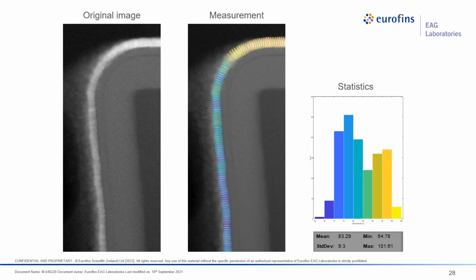It's a machine learning algorithm that can automatically make all these hundreds of measurements, and from the graph you can already see that the top is relatively thick, on the right or thicker side of the histogram, right? So you have a visual, and also a quantitative impression of your device.